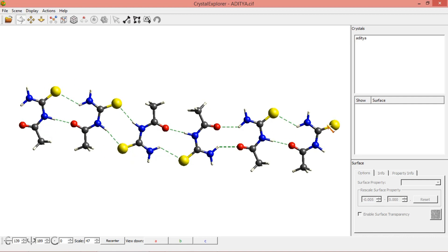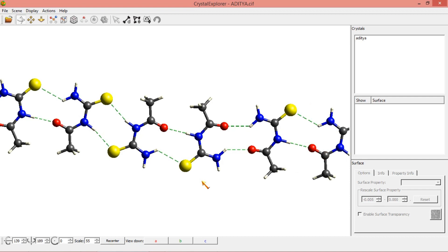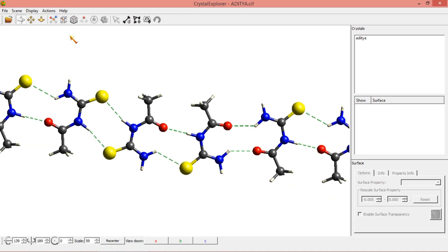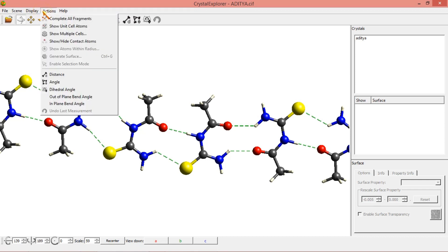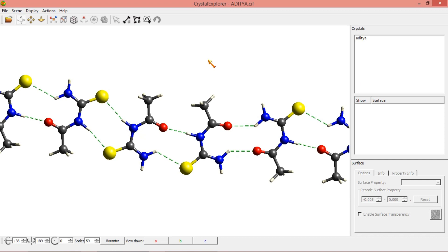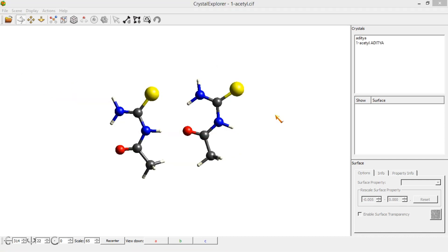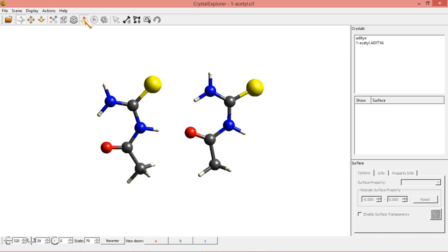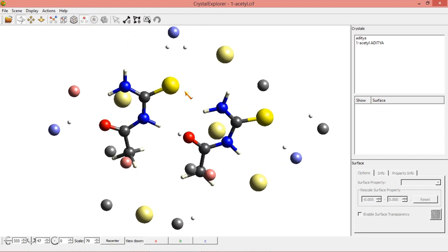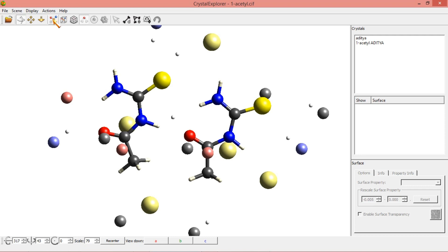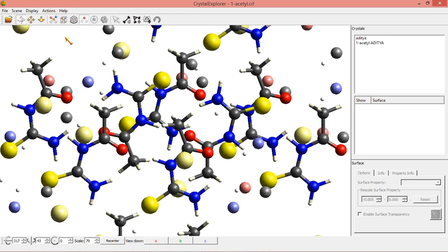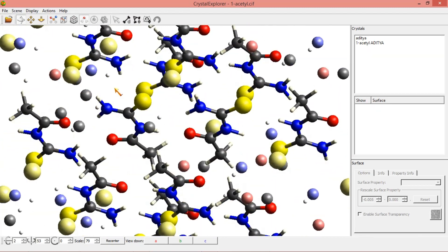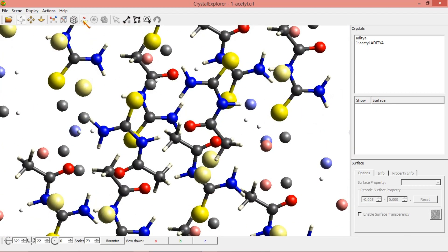These are the inter and intramolecular interactions. It is a very simple way to get inter and intramolecular interactions — just click on to this. You will be getting a fragment like this. Click on to get all complete fragments. Click again and you will get a structure like this. Then click Hide/Show contact atoms — if I click again the contacts will be hidden.